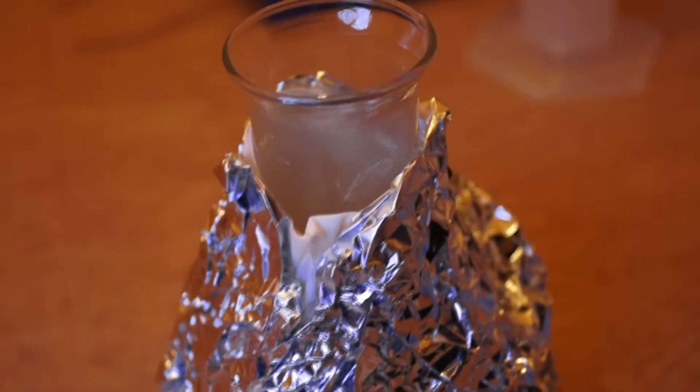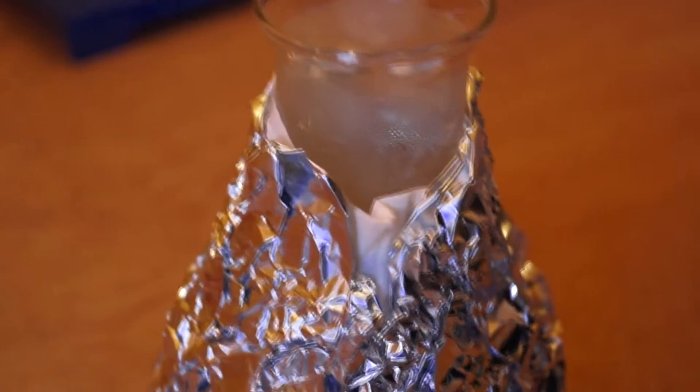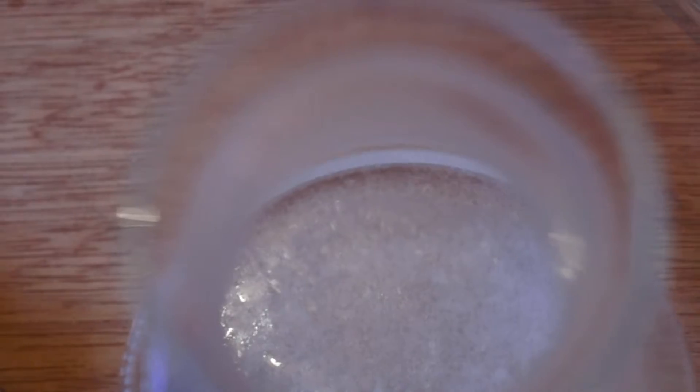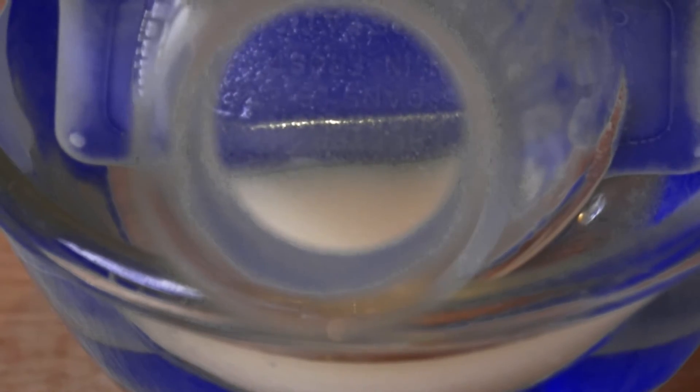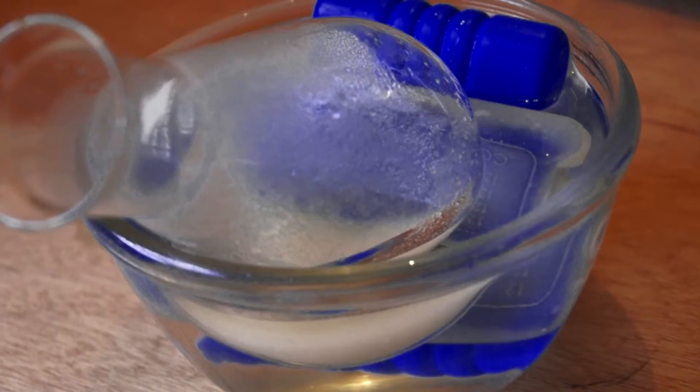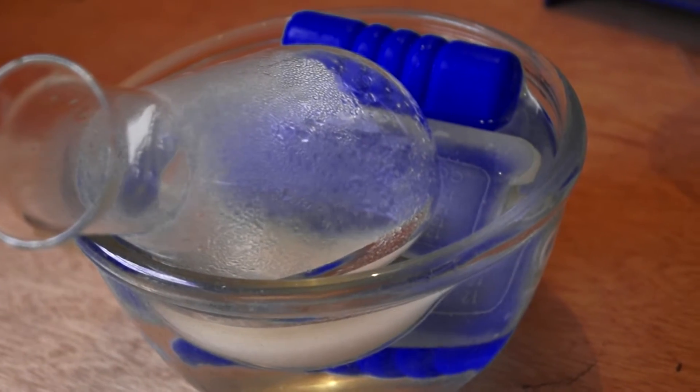Allow the solution to cool slowly in order for crystallization to occur. To do this you can use some kind of insulation like tissue paper and tin foil. Once the solution reaches room temperature you can put the conical flask into an ice bath to further aid cooling.